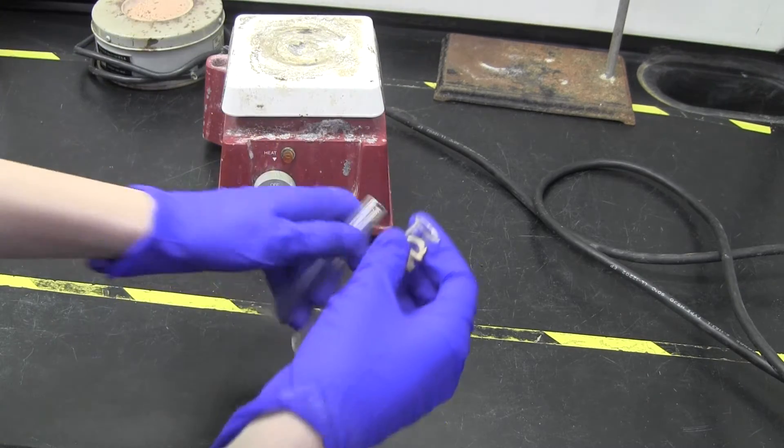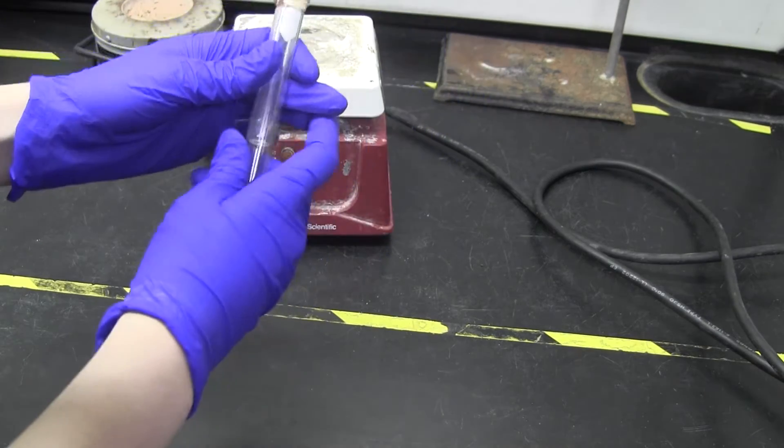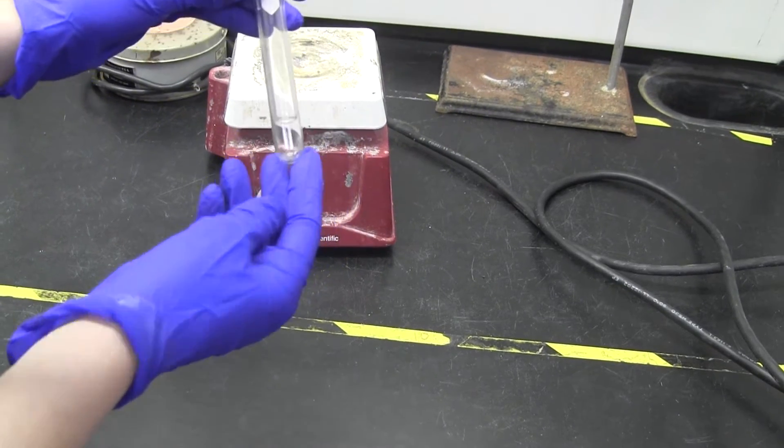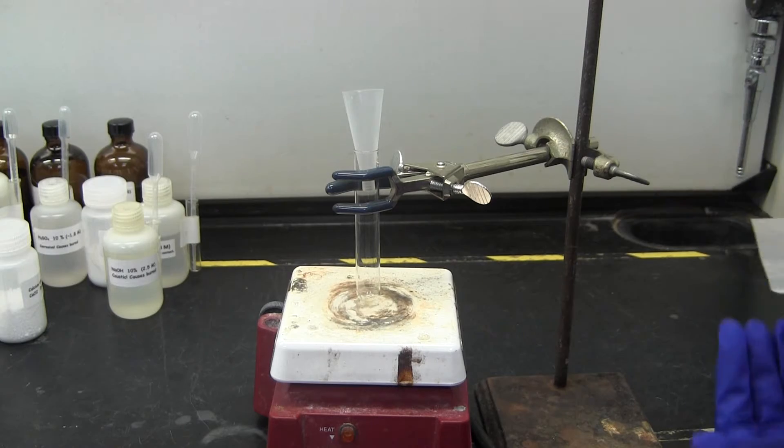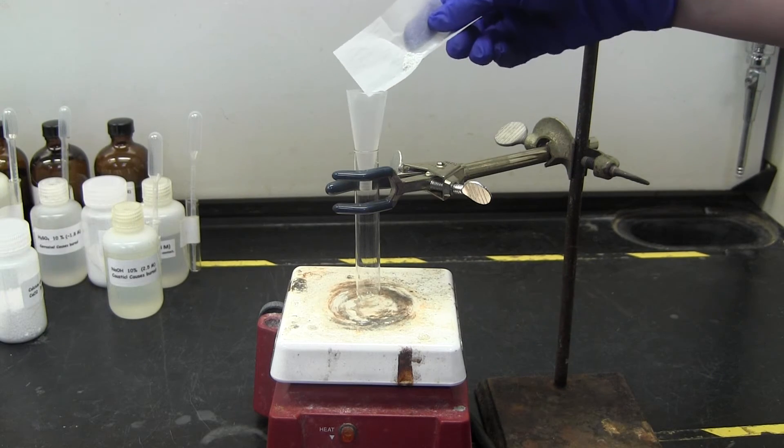The placement should create about an inch gap between the bottom of the large test tube and the bottom of the small test tube. Once the correct placement is found, try not to move the rubber band, but separate the two tubes to add your unknown.